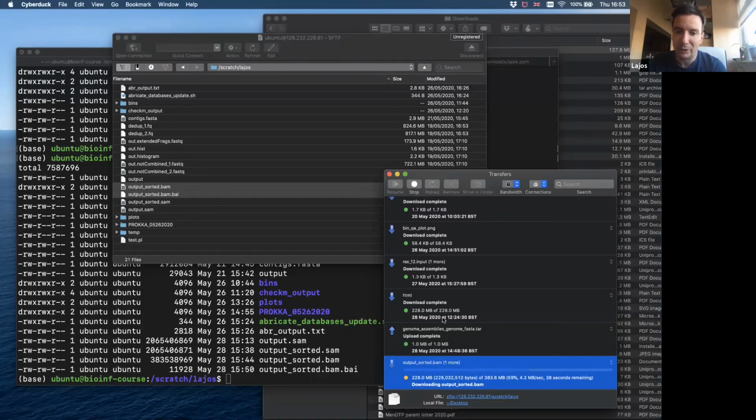The reason why you really want to see this in the graphical user interface as well. Of course, if you are looking for example at SNPs, if you want to check how many differences you have between a reference genome and your own sequencing, you will not sit down in front of the BAM view and go through the whole 2.5 megabases by hand and grab a pen and record all the differences you see. For this, we will use a program, which we will discuss next time, it seems.